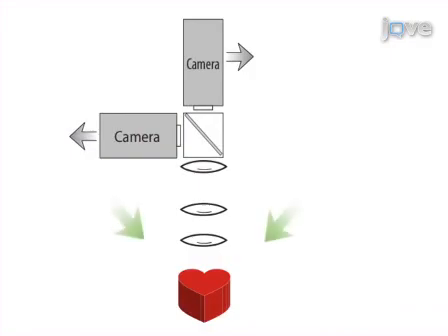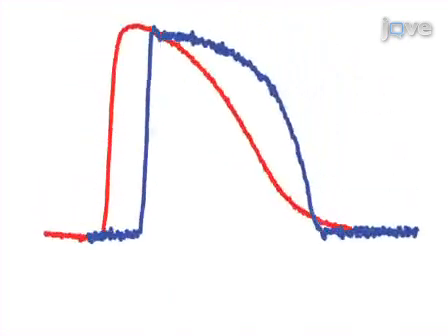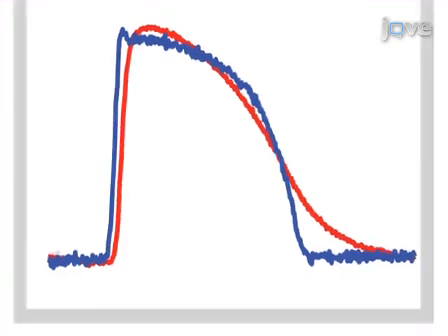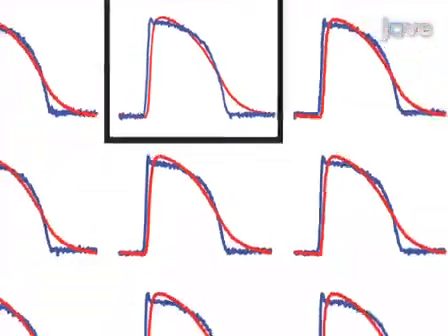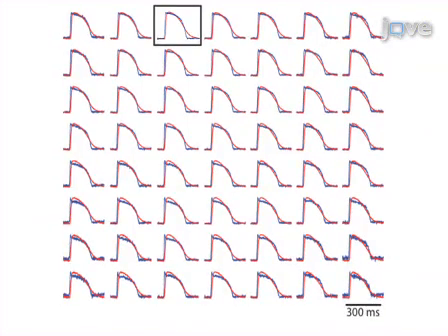During this step, the optical action potential and calcium transients can be recorded simultaneously using the non-panoramic dual imaging system. This procedure provides quantitative data of the spatial and temporal myocardium excitation and repolarization, as well as congruent characteristics of calcium handling, which can be analyzed during regular rhythm, as well as atrial and ventricular arrhythmia.